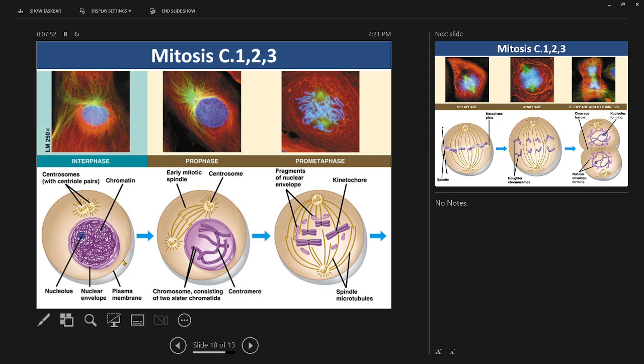Here are some more examples of what to expect when you see this. So here is interphase with the cell doing its normal function. In prophase, we break down the nucleus and the chromosomes copy themselves and form. So this is what that's showing here. It says, don't worry about pro-metaphase. Just think of this as prophase. So in prophase, we lose our nucleus. The chromosomes have copied themselves.